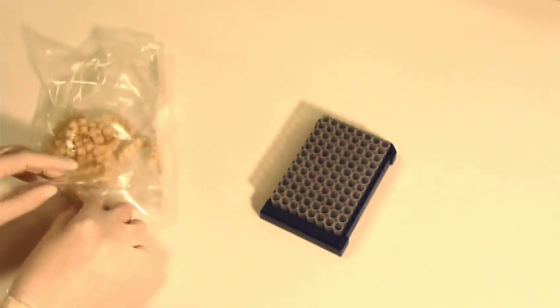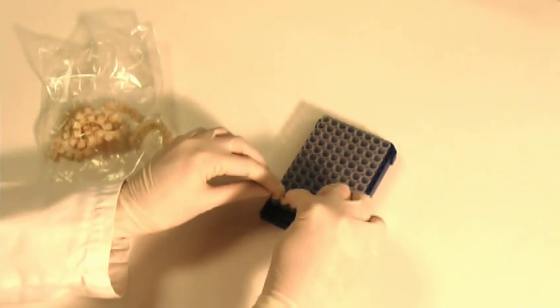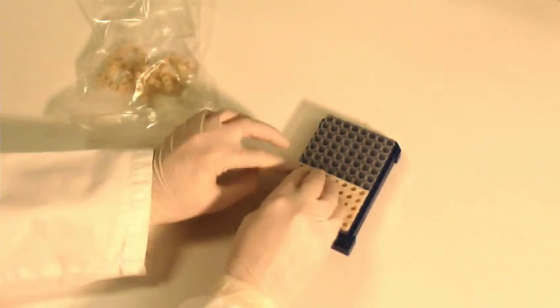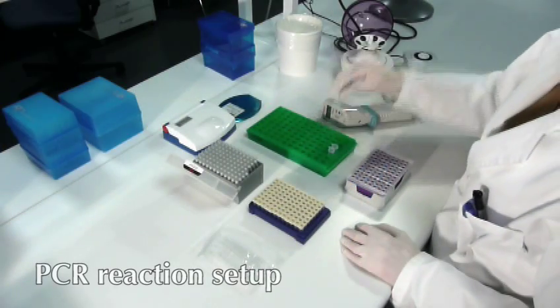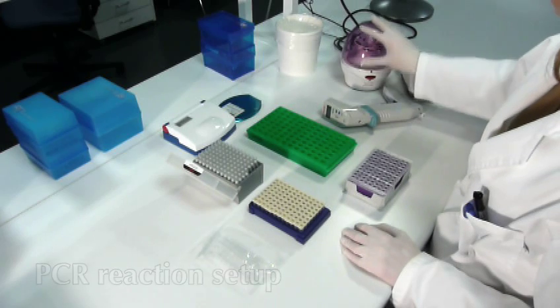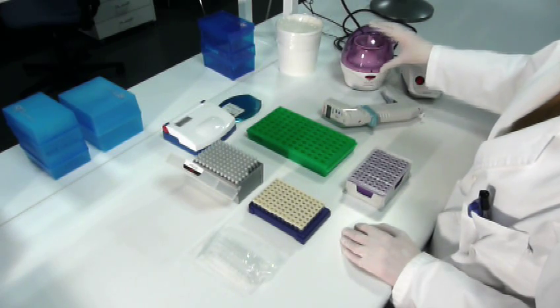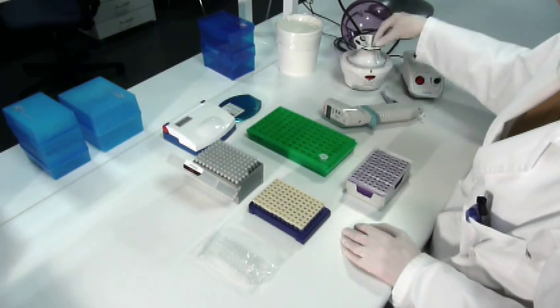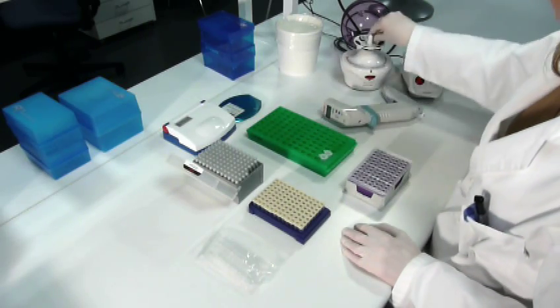Purified bacterial DNA is now ready for detection with real-time PCR, or it can be placed into long-term storage. The bacterial DNA is mixed with PCR reagents, including buffer, enzymes, and specific short DNA fragments. These components are supplied as a master mix, so the PCR setup takes only a few minutes.